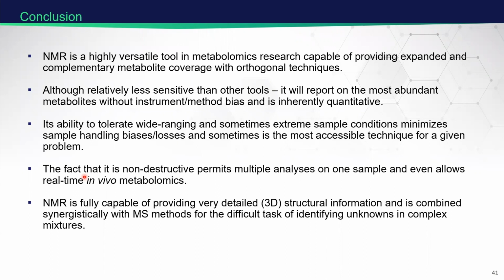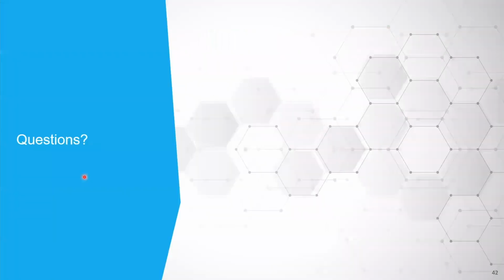And sometimes, as in the case of those hydraulically fractured shale produced fluids, it's the most accessible technique for a given problem. As we saw, the fact that it's non-destructive permits multiple analyses on one sample and even in vivo metabolomics. It's also fully capable of providing very detailed 3D structural information and can be combined synergistically with mass spec for the difficult task of identifying unknowns in complex mixtures. With that, I'll conclude and I'll be happy to take any questions.